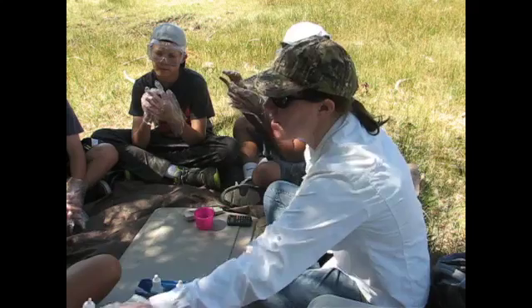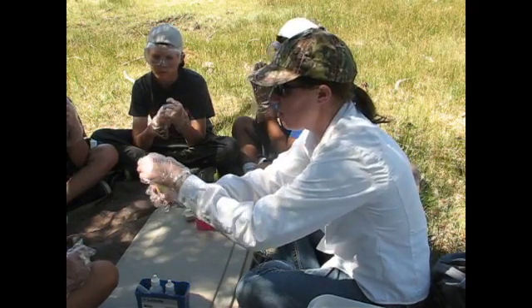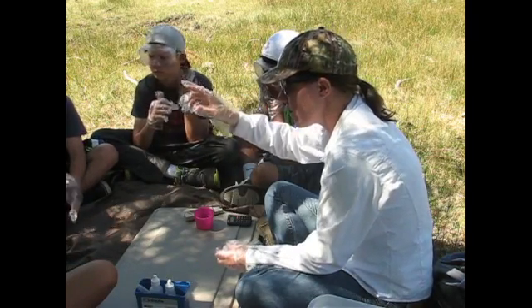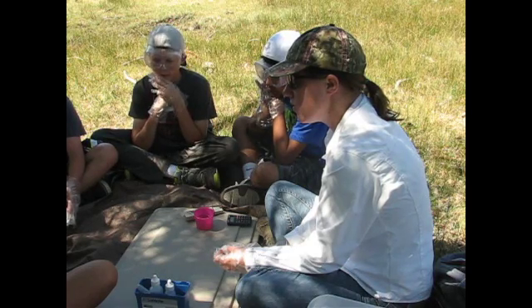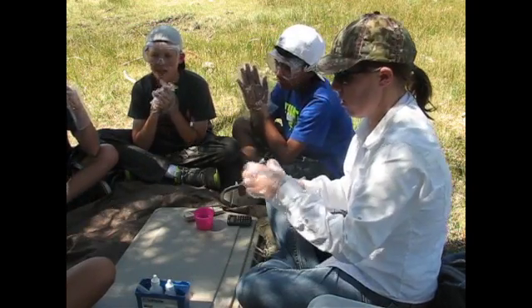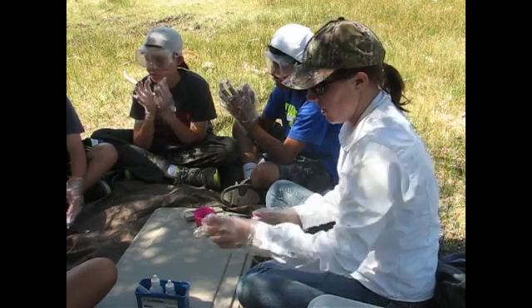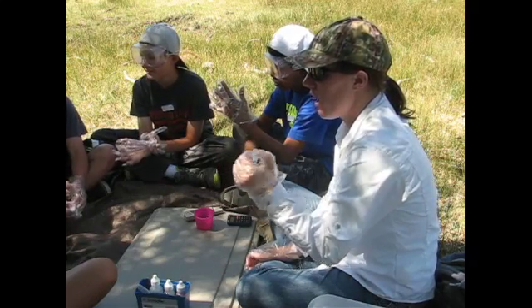Perfect. Okay, and then you can pass it to Christian. Isabel, you're going to be adding 5 drops of the pink. Make sure you hold it upright, vertically. 1, 2, 3, 4, 5. Okay, and then if you'll put the lid on. Could I shake it? Yeah, she can shake it. Put your thumb over the top, and then you have to shake it up.